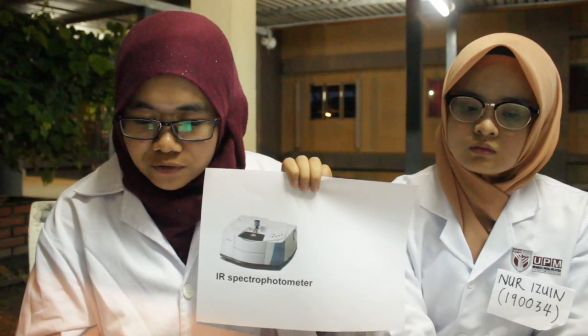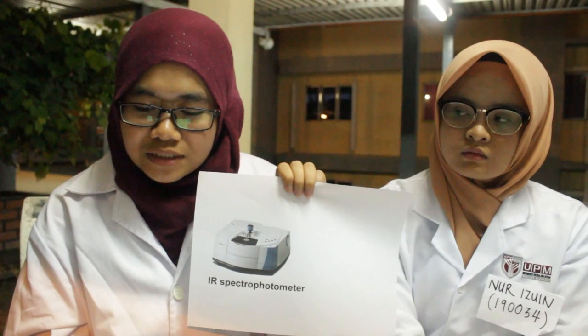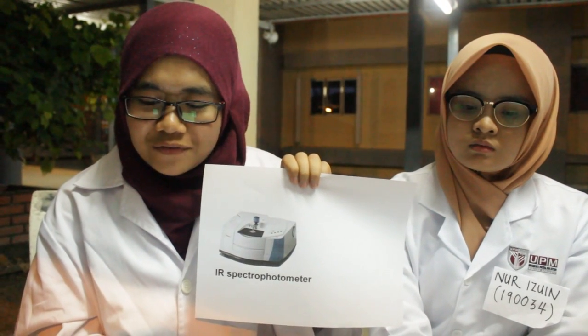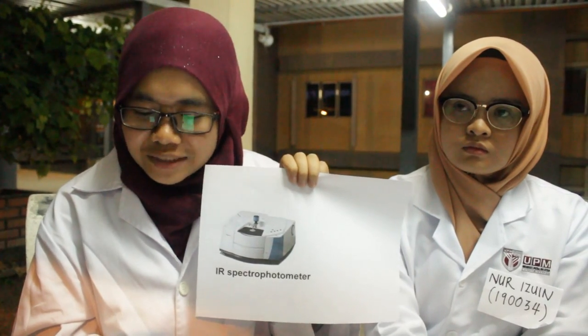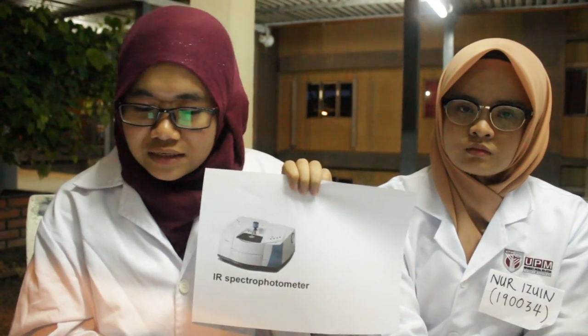In visible spectrophotometry, the absorption or the transmission of a certain substance can be determined by the observed color. For instance, a solution that absorbs light over all the visible range, in other words transmits none of the visible wavelengths, appears black in theory. On the other hand, if all visible wavelengths are transmitted, it absorbs nothing, so the solution sample appears white.